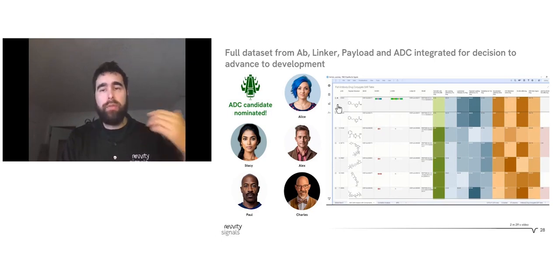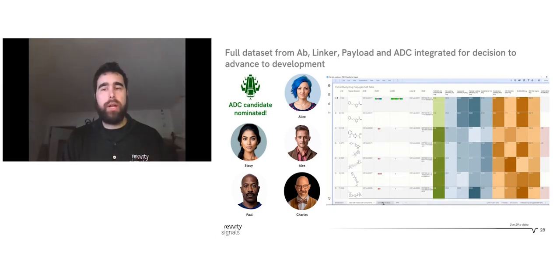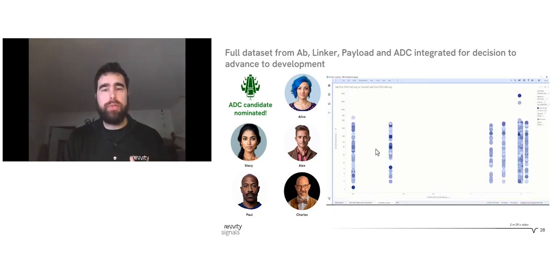So we can hover over this, pin a reference sequence, and see how these CDRs change to get a snapshot view. Comparing payload versus ADC, looking at correlation analysis between the original payload test results is very nice. But I think the end goal really is to get to this final dashboard, which we'll show in just a moment.